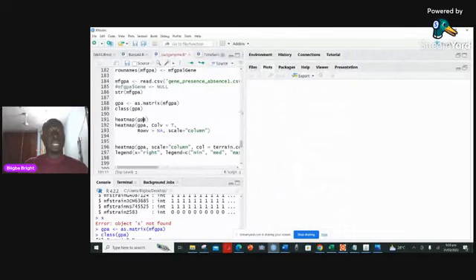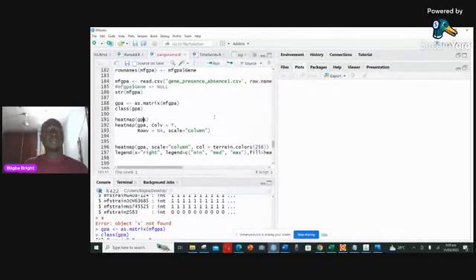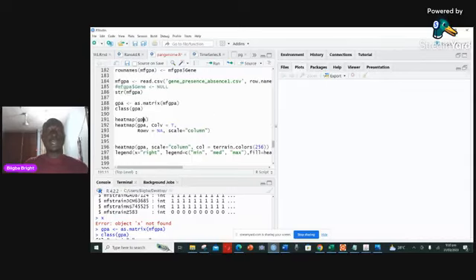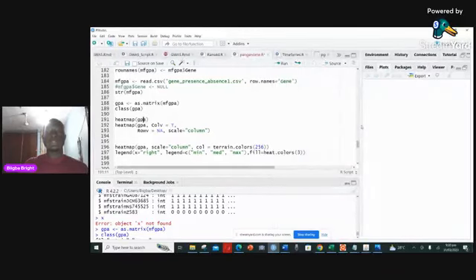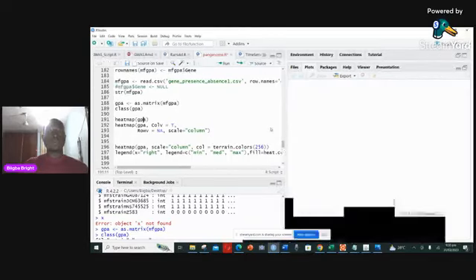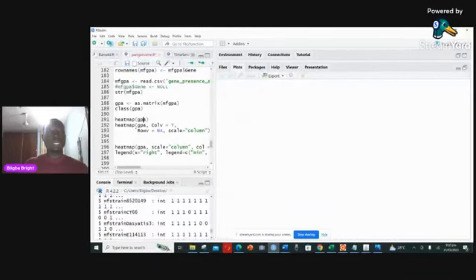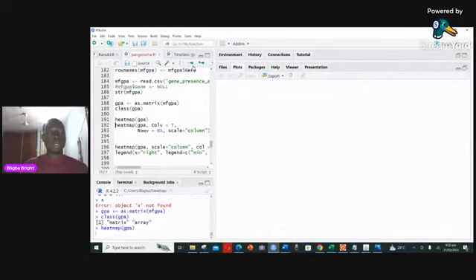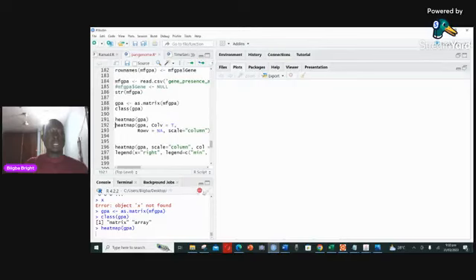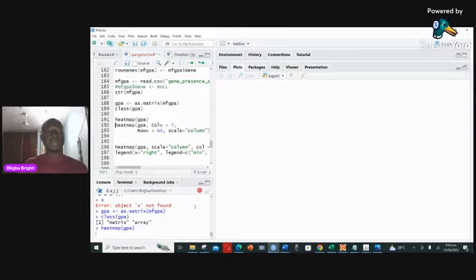The heatmap generates from a huge dataset — about 11,000 to 18,000 entries — so that's a lot of data. Make sure the plot panel is always wide enough. If you narrow it, it will say the margins are too small and won't run. So I'm widening it up like this, leaving only a small space for the script, and then running it. You can see in the console that it is working.